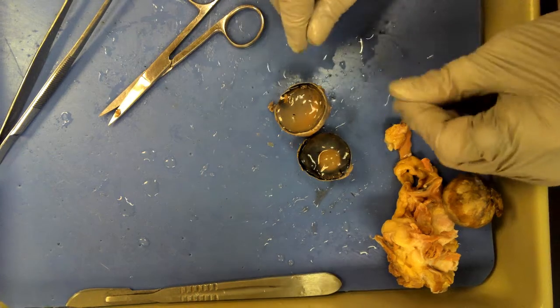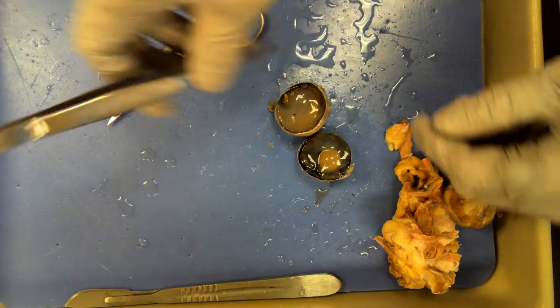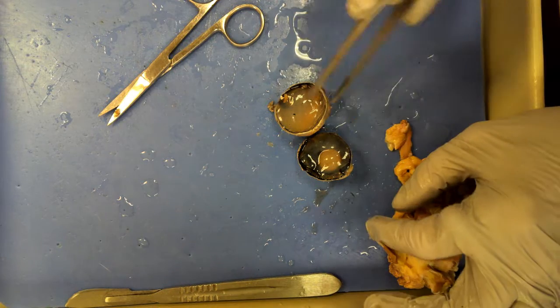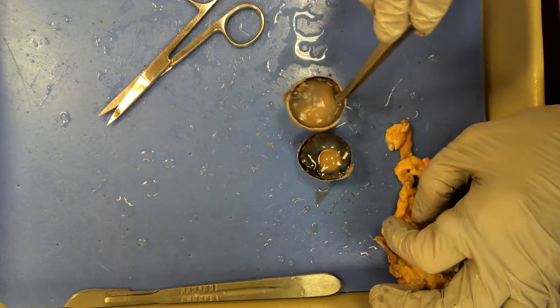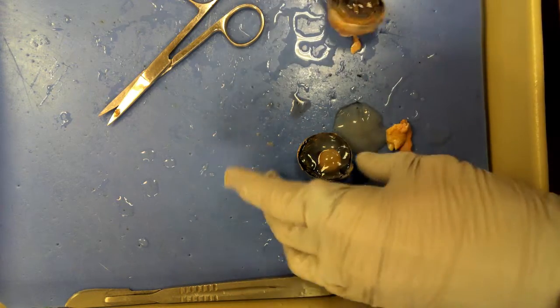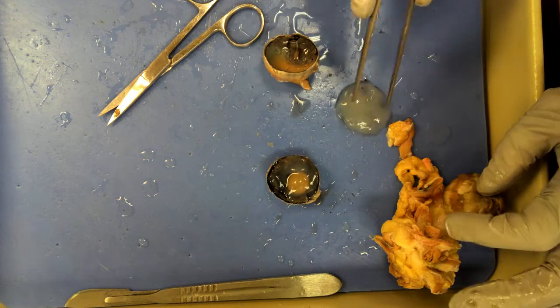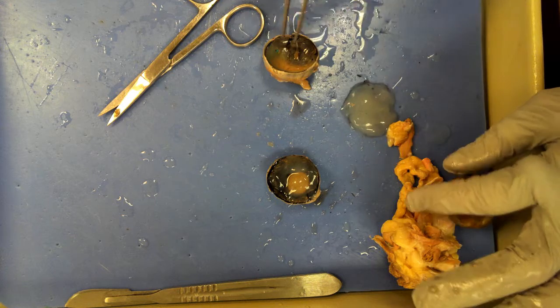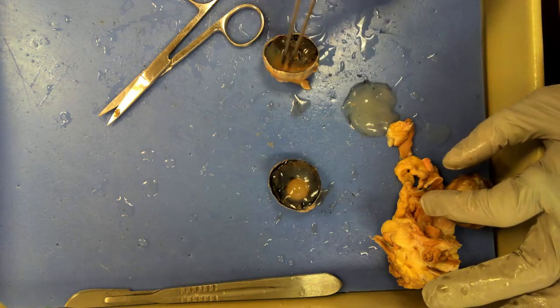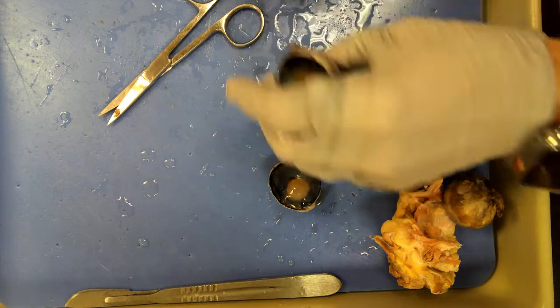Now I have both sides here. This is the back of the eye, and that gel stuff — I didn't mean for it to fall out but it did — that is vitreous humor. It came from the vitreous chamber, which is everything behind the lens all the way to the back of the eye.